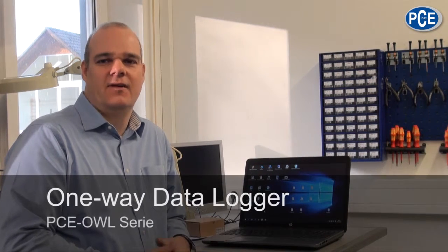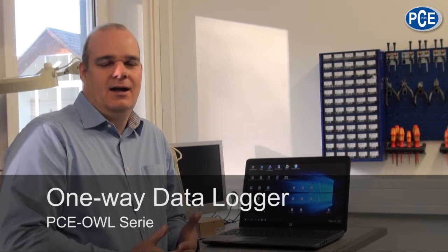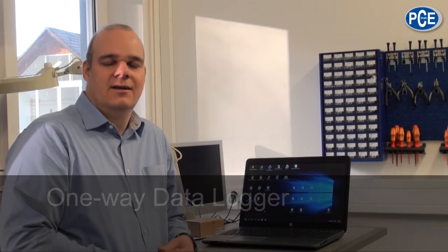Today I have a one-way data logger. That is the PCE-OWL 6, which comes in two models, the OWL 6 and the OWL 60. That means you can log temperature with this device once over 6 days and once over 60 days.